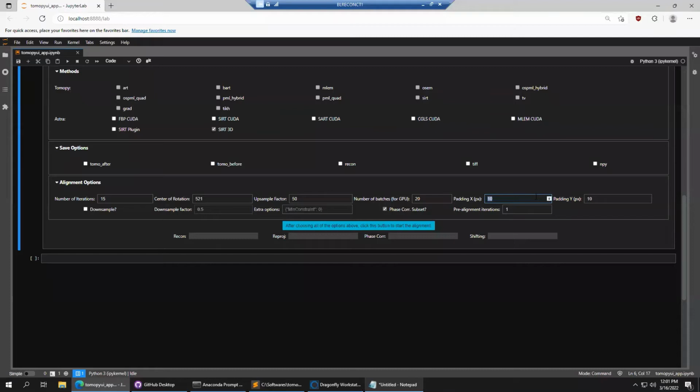Hey, Stan, can I ask you a question real quick? Yeah, go ahead. For the save options, if it saves a TIFF, what is that TIFF of? Is it a stack of TIFFs or is it a TIFF of the... It's a TIFF image. It's just one image.